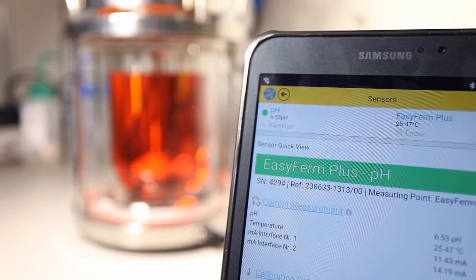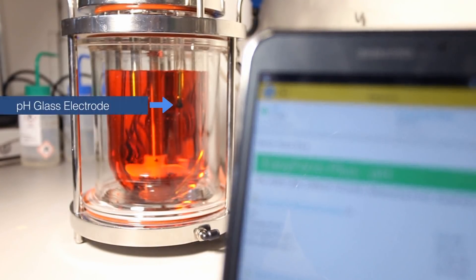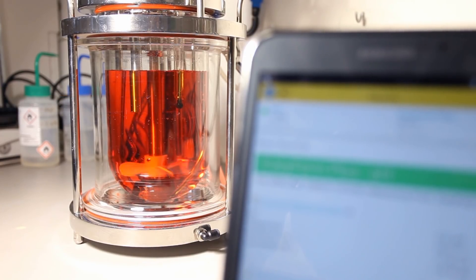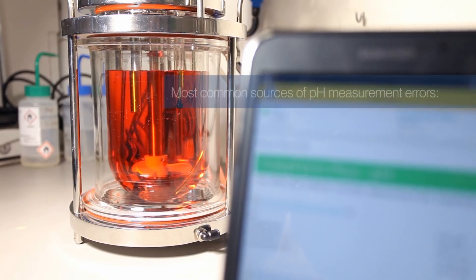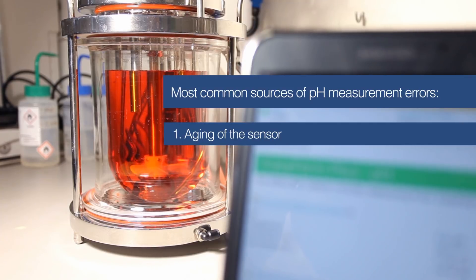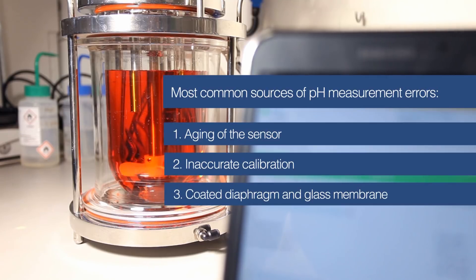The most accurate process sensors to measure the pH value are glass electrodes. To make sure they keep delivering their optimal performances, appropriate handling and maintenance is necessary. The most common sources of pH measurement errors are aging of the sensor, inaccurate calibration, and process material coating the diaphragm and glass membrane. This video will present the three most helpful tips on how to deal with these issues and improve the overall accuracy of the measurement.